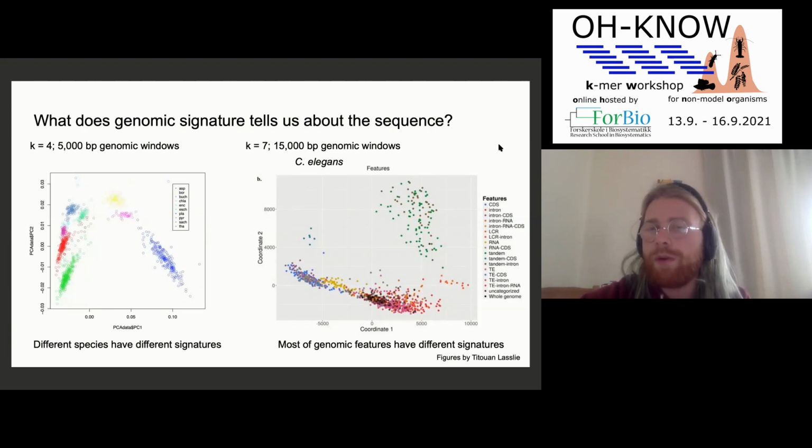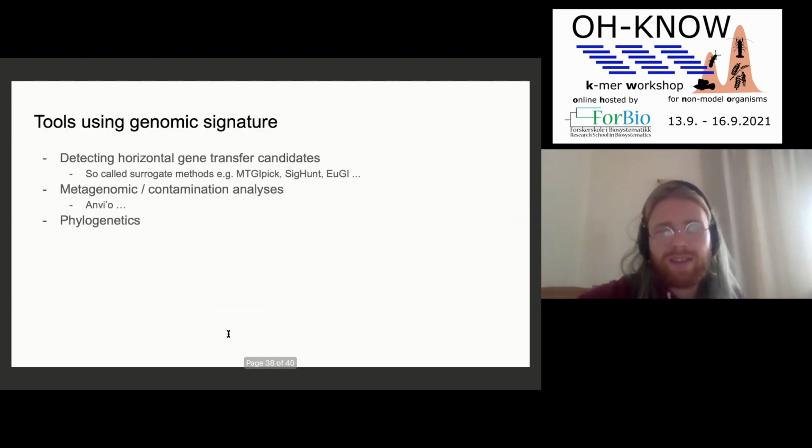So I think for species complexes like Anopheles, you would need to increase the K and start to look at the unique case for individual lineages rather than looking at Kmer frequencies. But actually, I'm not 100% sure because nobody ever tried. Yeah, that's cool. Thank you. Cool. Very cool thing.